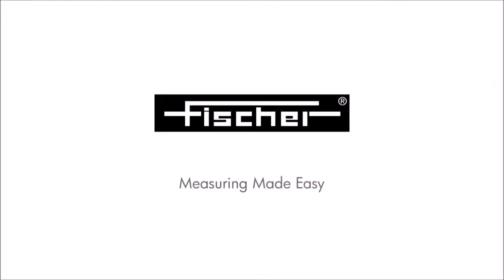This is the end of part one. Next, we have part two on ferrite scope features, such as specification limits and block sizes.